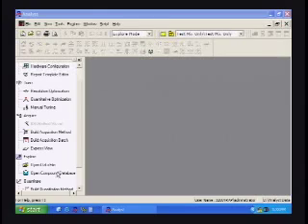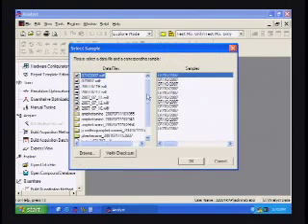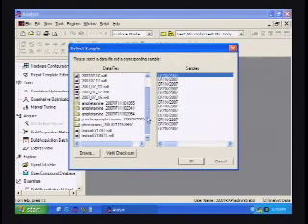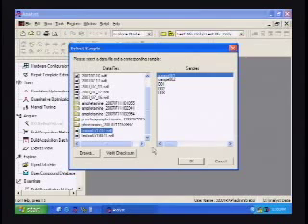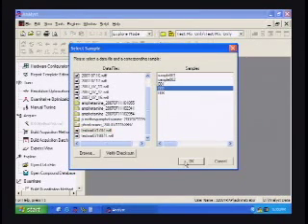The first thing we need to do is look for the data in the proper place. Remember, the data is organized into projects, so we're looking for test mix only. This is where we're keeping the test mix data. Let me go ahead and open a data file, going to explore on the navigation bar, and let's try test mix 717, sample 2.